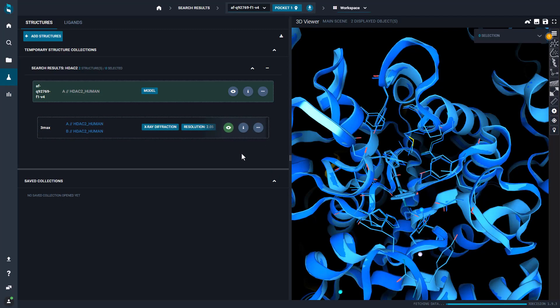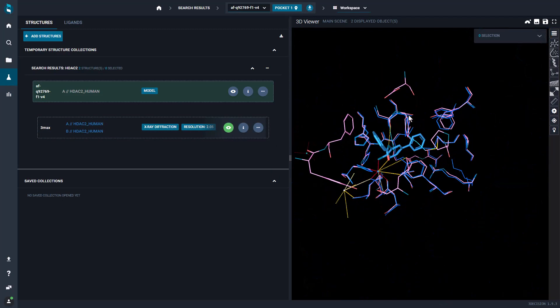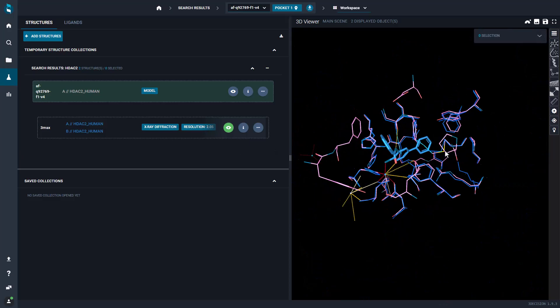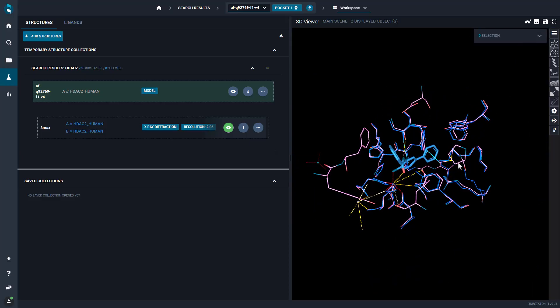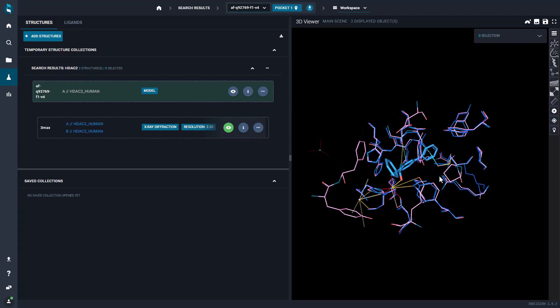By adjusting the representation option, you can see how the binding site was nicely predicted by the AlphaFold model.